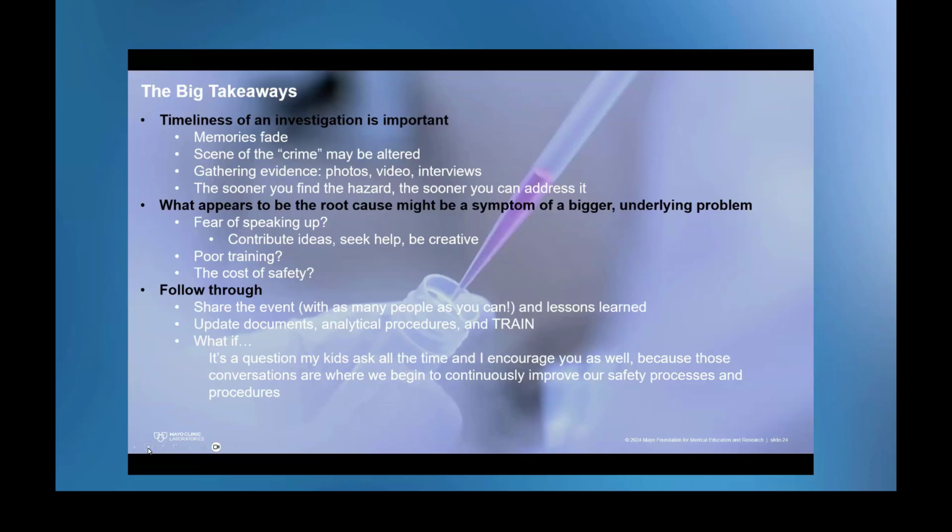Using the root cause analysis methods, or perhaps others, you will find that you are really getting to the root of the problem. Remember, you've got folks who may be afraid to speak up. Be creative in how you gather their feedback of the event, but think about the cost of what has gone wrong and the cost of poor training.